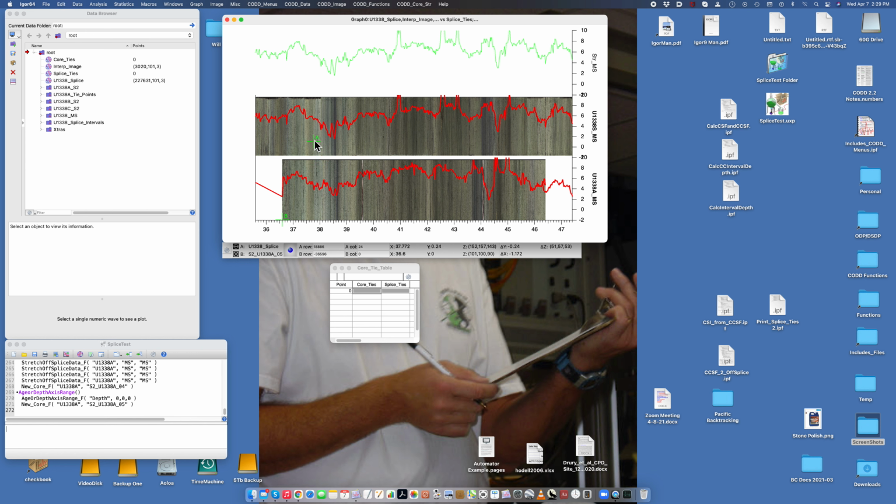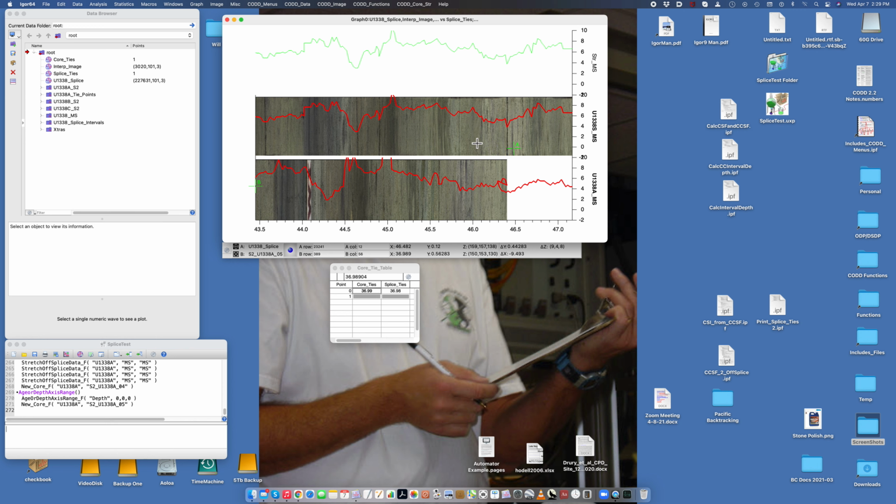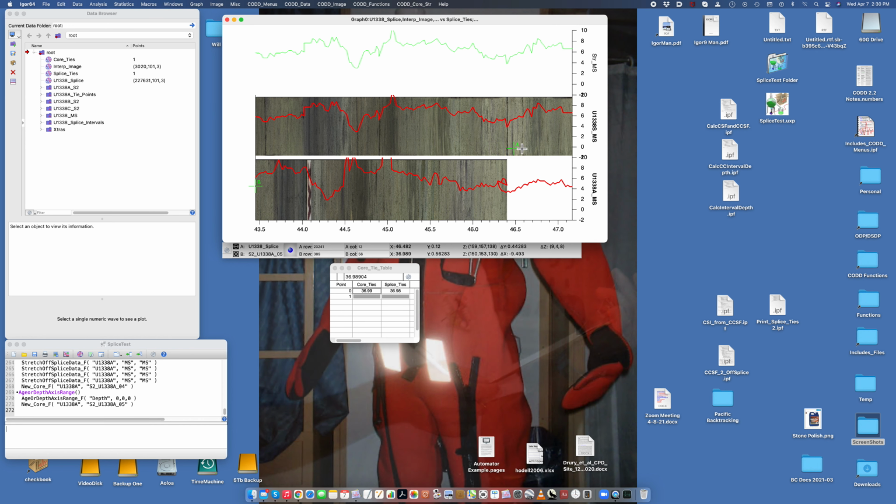So again, doing that sort of far away, nearby, you can see you've got this and you've got that. So you might do a little bit on the downside of that peak. We'll do this, say here, we'll establish that tie point. And then we will go down here. You can see you've got this, let's open that up a little bit. You've got this kind of zone in here that has a bunch of little layers.